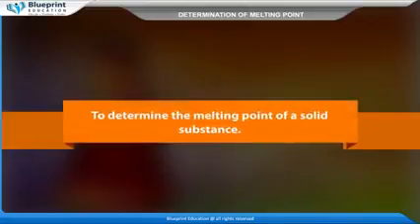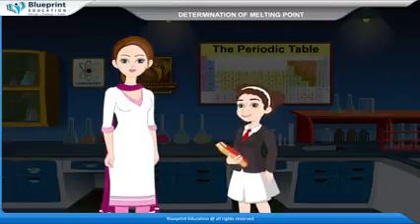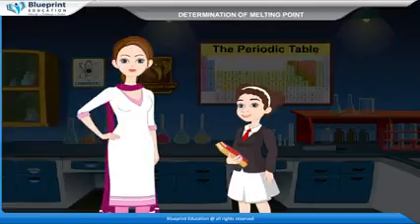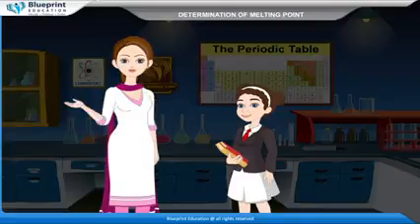To determine the melting point of a solid substance. The melting point of a substance is defined as the temperature at which the substance changes from solid to liquid state. At this temperature, both the phases, solid and liquid, are in equilibrium.